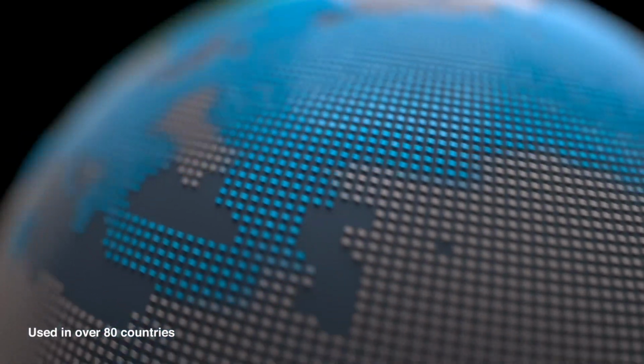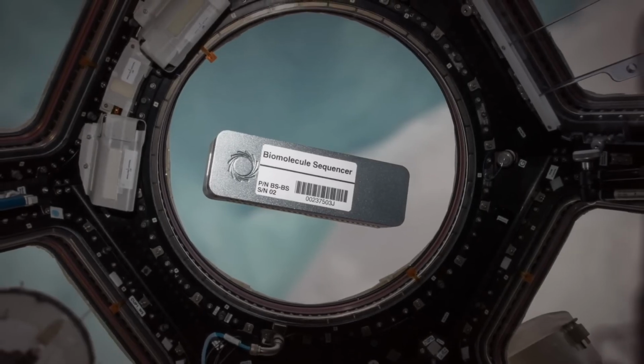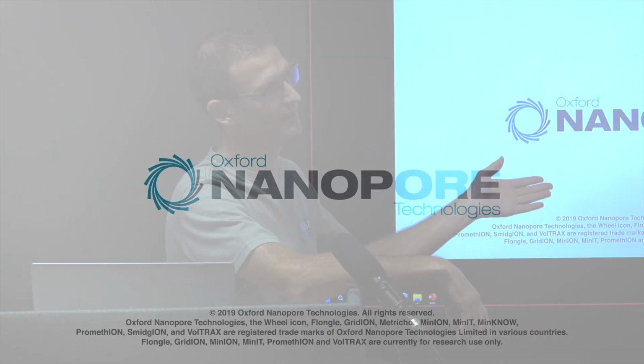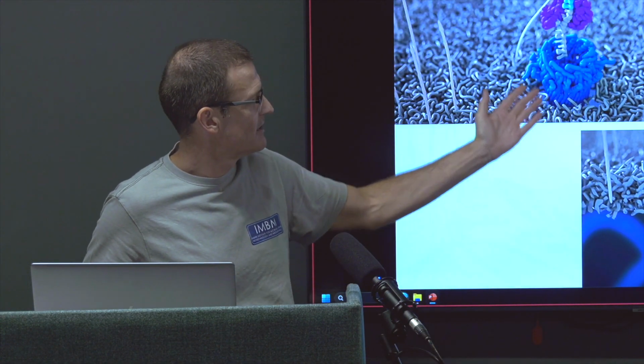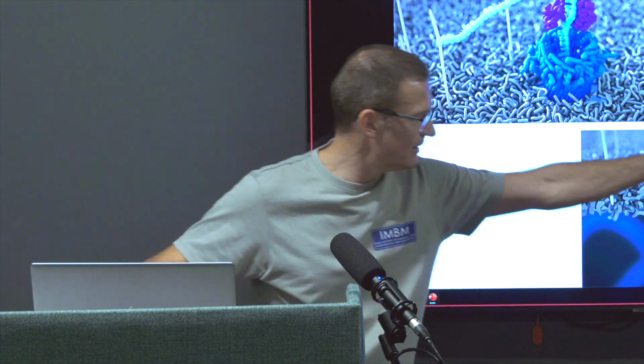Mind-blowing technology. You're going to see the thing and you're like, what? This is it! But the road to developing this technology, it's amazing. I need to become an Oxford Nanopore salesman because this is like the coolest stuff out. So yeah, just again to show you the 2 main features of this: the DNA going through the pore, and an electrical signal gets generated.